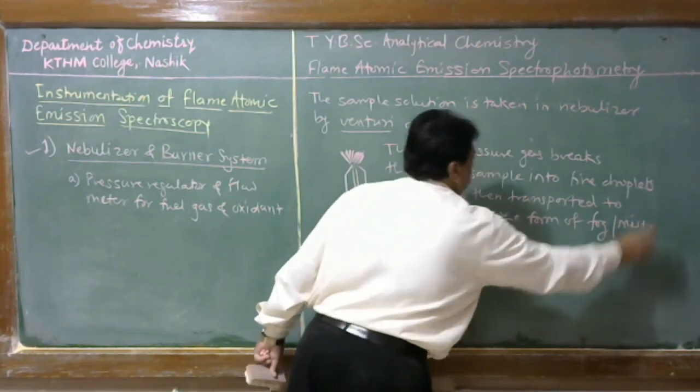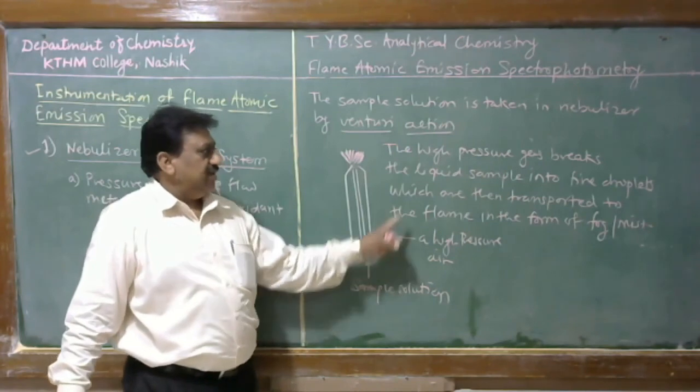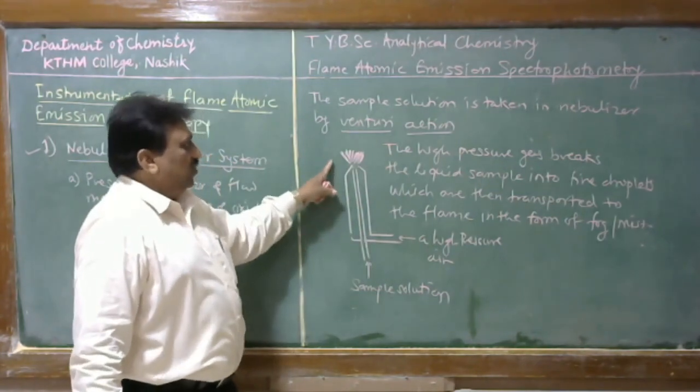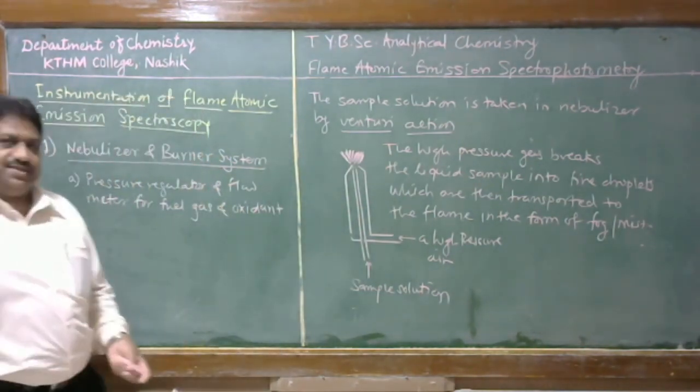The functioning of this atomizer determines the droplet size of the sample solution. Therefore, this is the first component, the nebulizer and burner system.